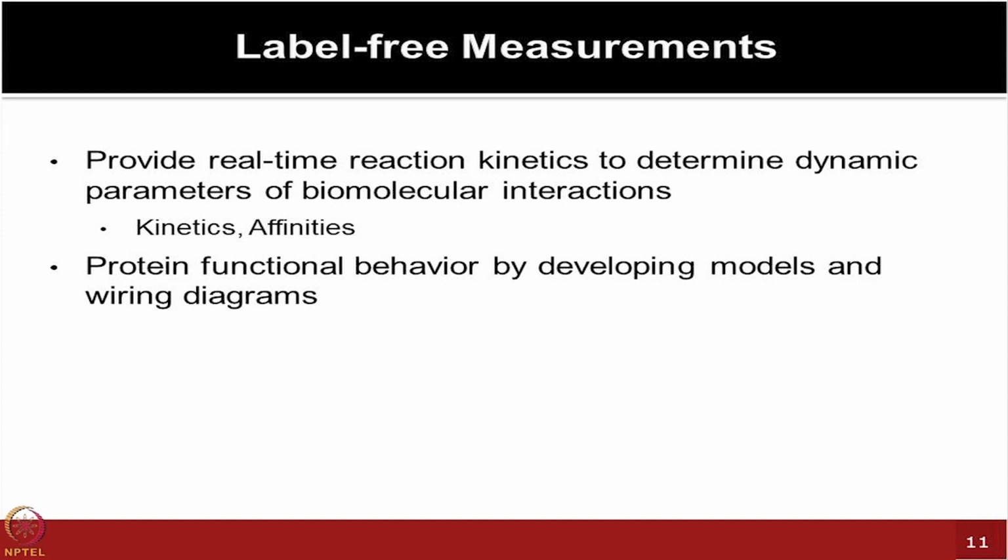So let's say for a given protein, wild type condition and its many mutant forms which you want to test for their affinity with a drug or with another molecule. Now you can build, let's say, from 50 of the mutants, some values which can give you some models. And now can those models be used to predict the behavior of another unknown mutant?